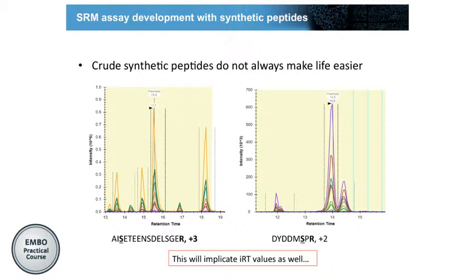They shouldn't drift in time and things like this. Sorry? They might be over-fragmented after the Q1 window. So after the Q1 window, there's a lens and they go into the... But what can happen, that is to some extent correct, is that they are arriving at different times to the Q1 window.